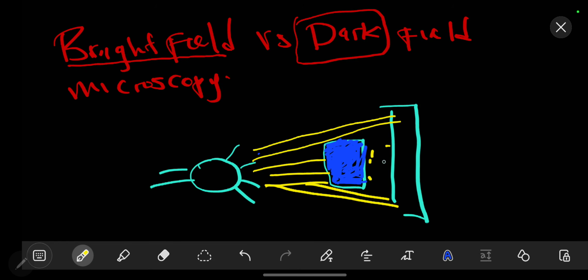So at this point, how will the image look, since the light is passing at all points except this point? You may realize that the image that will be formed, this is a real life practical example, will be a dark image. Though you cannot see the distinction, this is your dark image. Why is it dark? The reason is simple, because light cannot pass through like that.